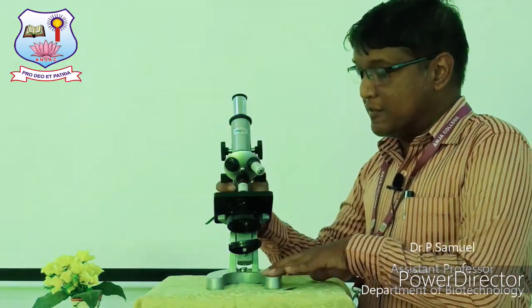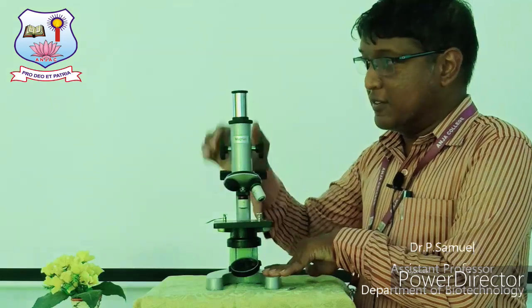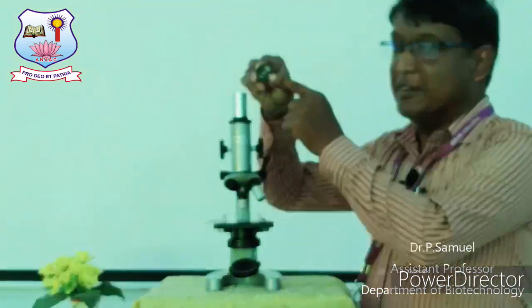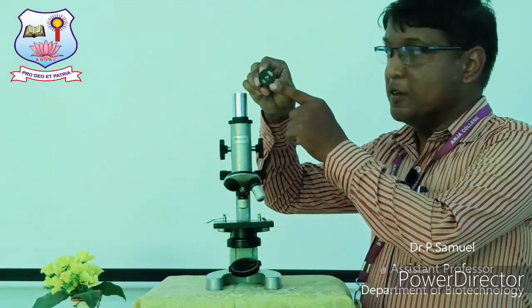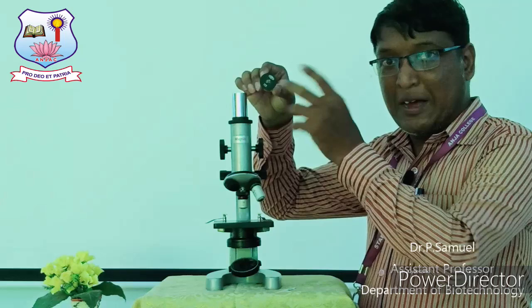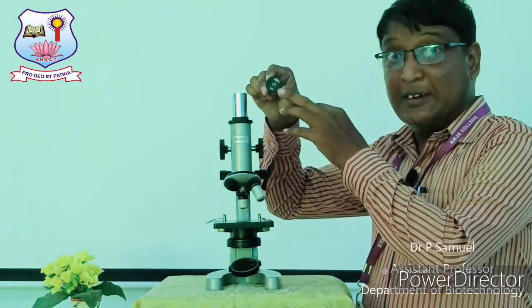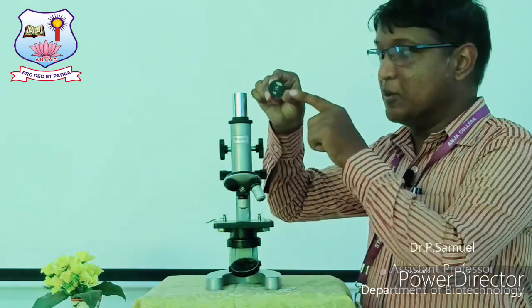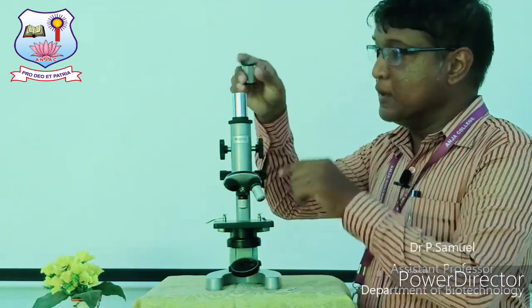The eyepiece is fixed, and its power is 10x. Through this lens, you can magnify the object 10 times its original size. That is why it is given as 10x power.